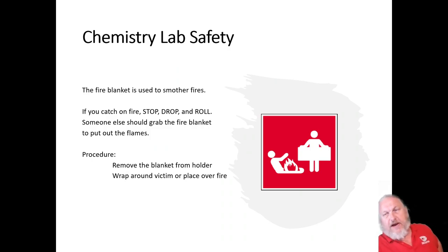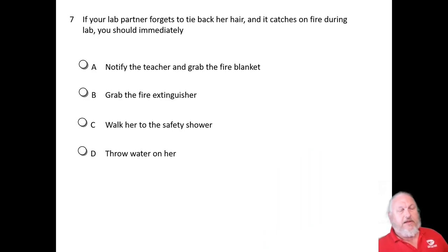Now again, use the fire blanket to smother fires. If you catch on fire, stop, drop, and roll. If someone sees you on fire, they grab the fire blanket and then they cover you up in it. What do we do? Remove the blanket from the holder. It's on a shelf. I will show you. Wrap it around the victim and put out the fire. Check for understanding: if your lab partner forgets to tie back her hair or his hair and it catches on fire during the lab, you should immediately notify the teacher and grab the fire blanket, grab the fire extinguisher, walk her to the safety shower, or throw water on her? Pause. And we come back and of course the answer is notify me and grab the fire blanket.